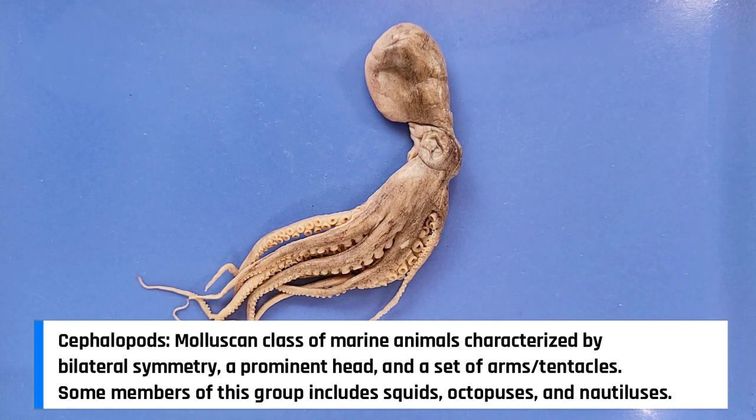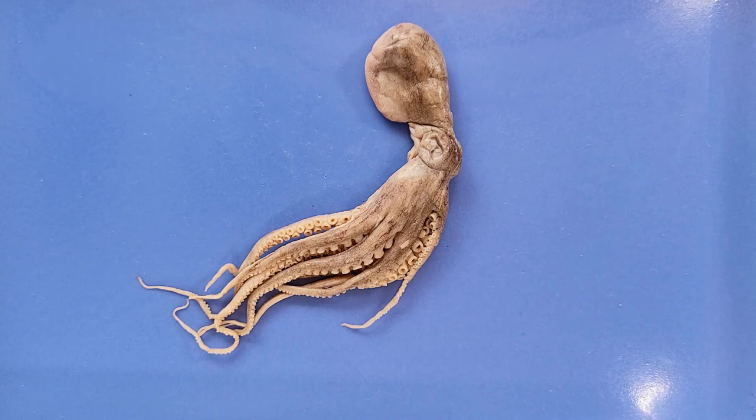Now, octopuses are sometimes called the closest thing to alien life on Earth. This is because octopuses, who are so intelligent that they're famous for outsmarting humans and escaping laboratories, diverged from the human evolutionary line long before the first primitive brain arose. This means that octopuses found their intelligence by an entirely different evolutionary path than ours. In other words, if you want to understand how alien intelligence could form, then octopuses are the closest thing we have. Now let's take a look at the octopus's external anatomy.